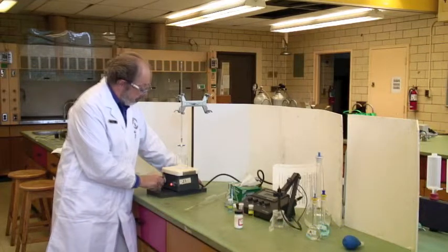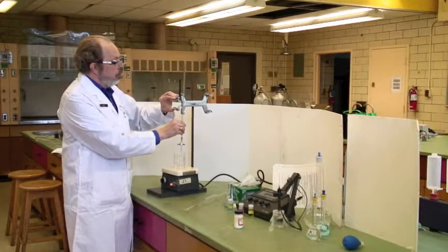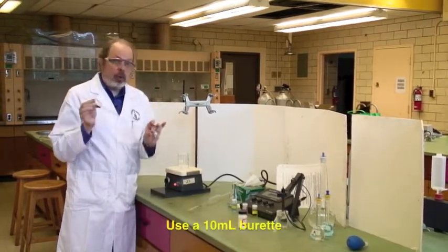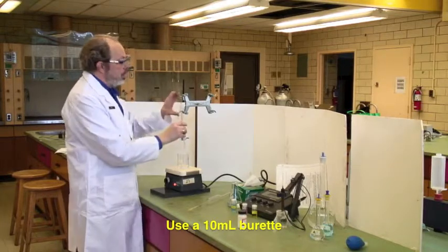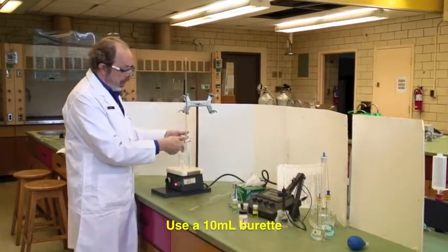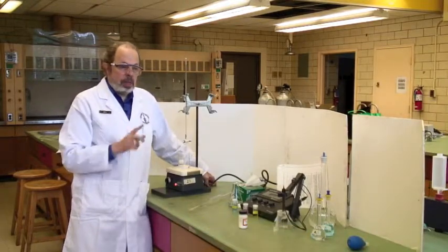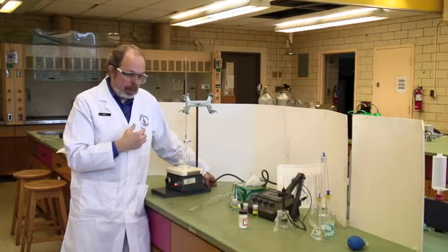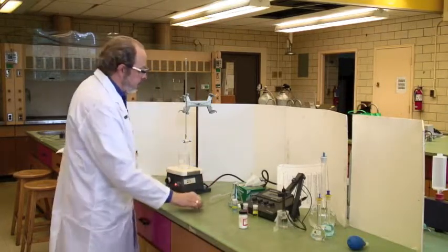When you're ready, turn the stirrer on. You'll be titrating with sodium hydroxide using this small 10-milliliter burette. Add small amounts from the burette into the titration vessel. The protocol tells you how much to add at various times.